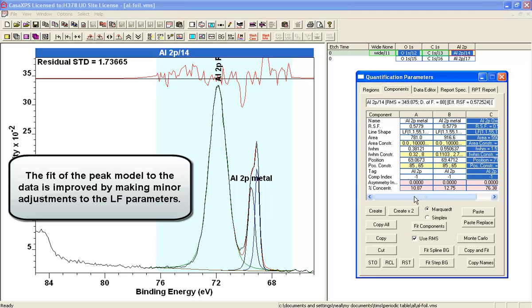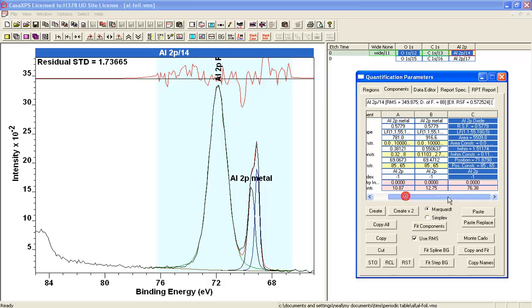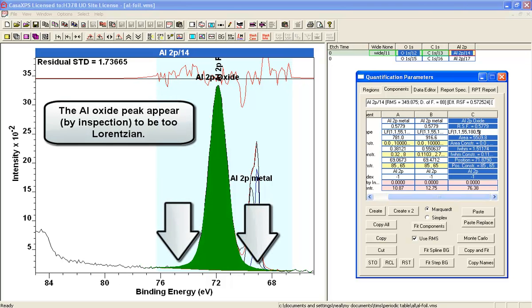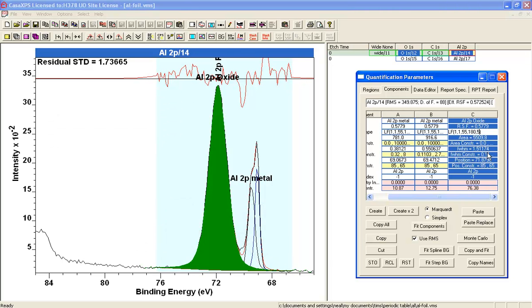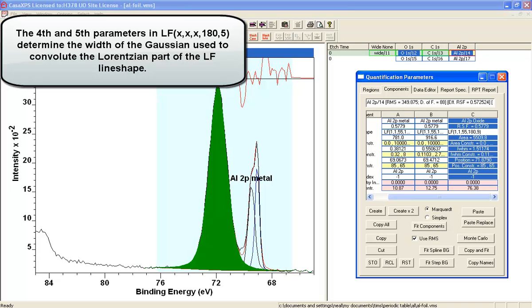So we'll begin by refining first of all the oxide peak, and you can see that the wings of the oxide are quite extensive. So what I'm going to do is apply a little more Gaussian contribution.